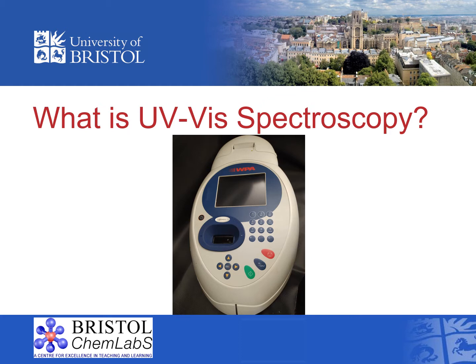Spectroscopy is the study of how the electromagnetic spectrum, or light of different wavelengths and energies, interacts with matter. UV-Vis spectroscopy specifically uses a range of light in the ultraviolet wavelengths and the full range of visible wavelengths. UV-Vis is one of a large selection of analytical techniques at a chemist's disposal: NMR spectroscopy, mass spectrometry, and X-ray spectroscopy, to name a few others. And by combining these techniques, you can learn a lot about a compound.